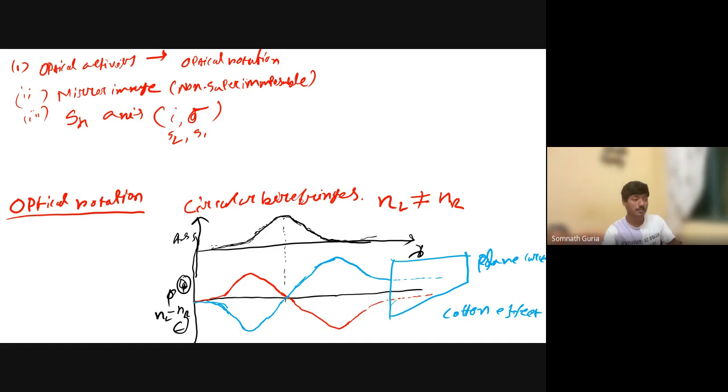Generally in our experiment, let's suppose we have a sucrose solution, where we are checking how sucrose is degrading under the influence of acid. We monitor it by the polarimeter. We have a sodium D lamp, which is around the 589 nanometer region, and my sucrose solution is colorless, so it should not absorb in that region.